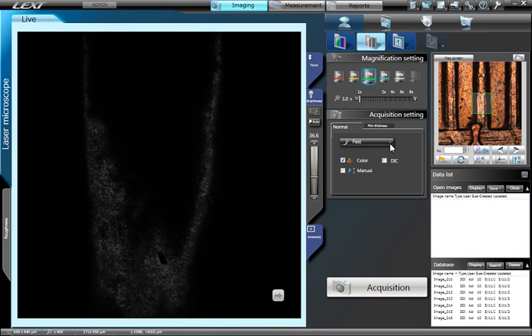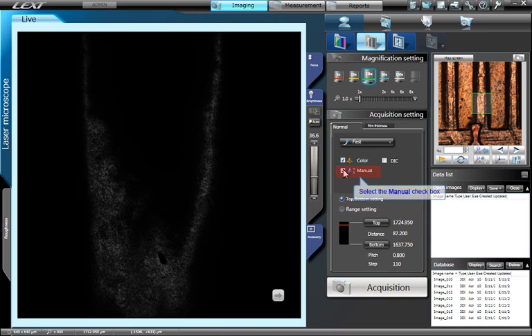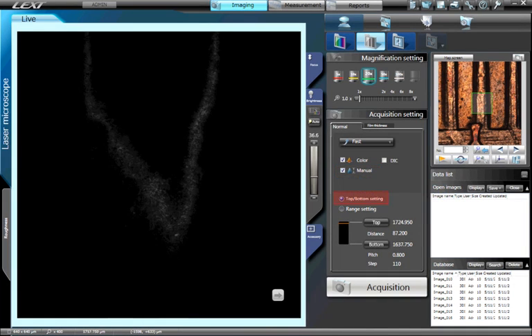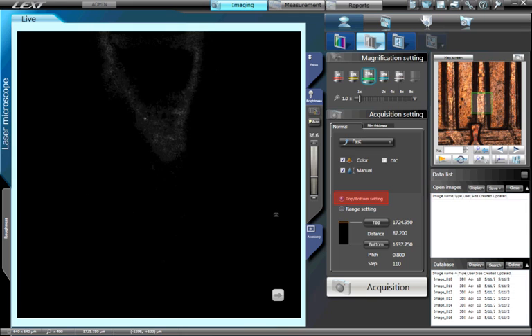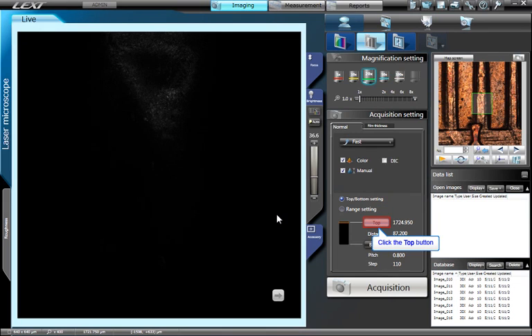However, you can also define the top and the bottom of the confocal acquisition manually by checking the Manual button. Ensure that the top-bottom button has been selected. Focus at the top of the feature, then press the Top button to define the top of the confocal image. Do the same with the bottom.